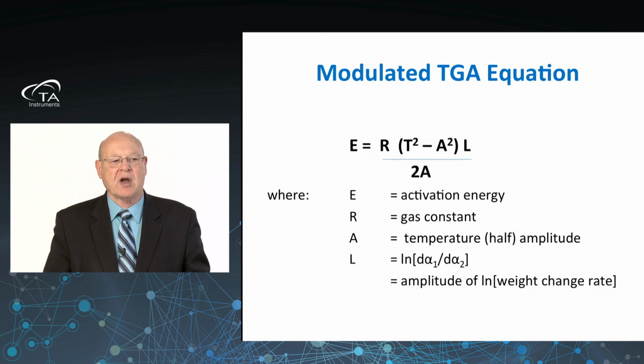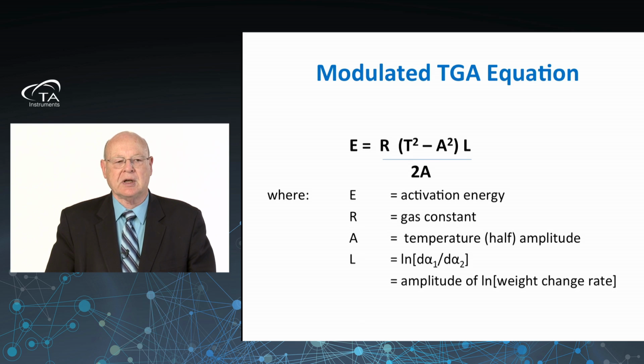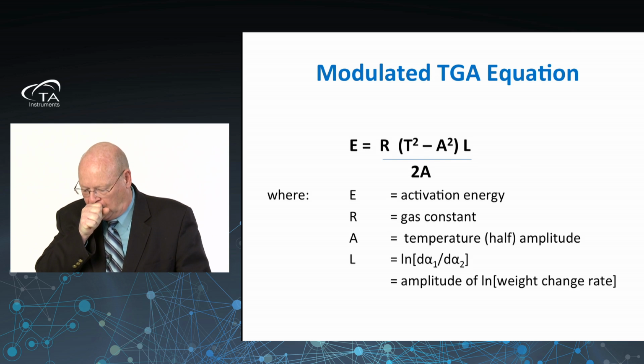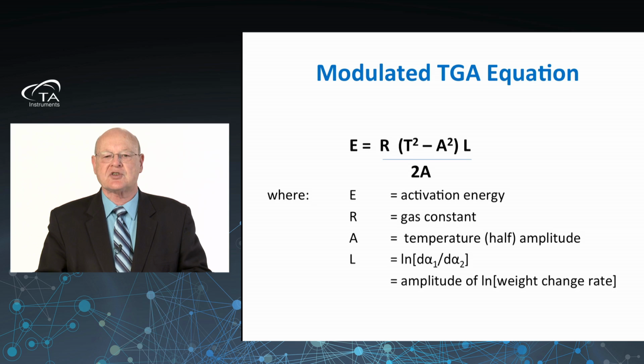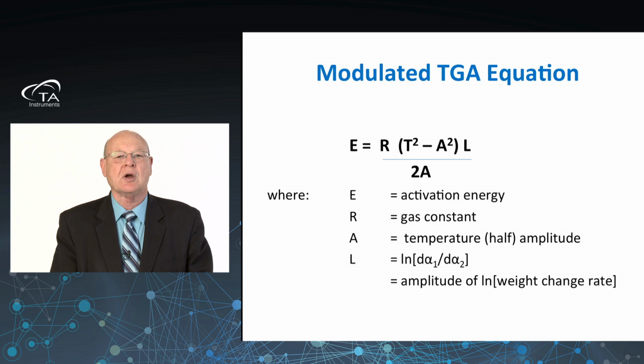Now, in modulated thermogravimetry, we use a Fourier transform process to be able to gather information over the complete process of the temperature program. If we use a sinusoidal temperature oscillation, the derivative of the oscillation is also a smooth continuous function, and this permits the Fourier transform. One could also perform the test, as Brian Dickens and Joe Flynn did in the factor jump method, using stair-step profiles.